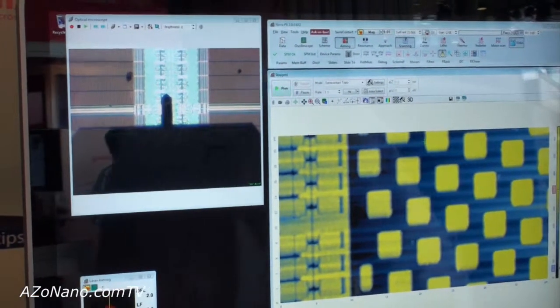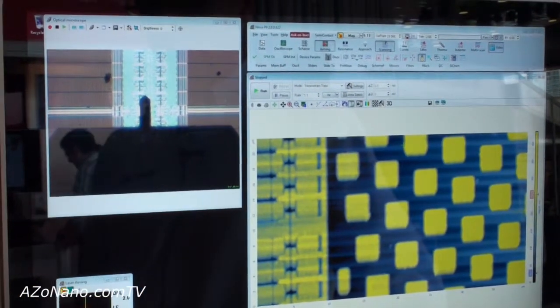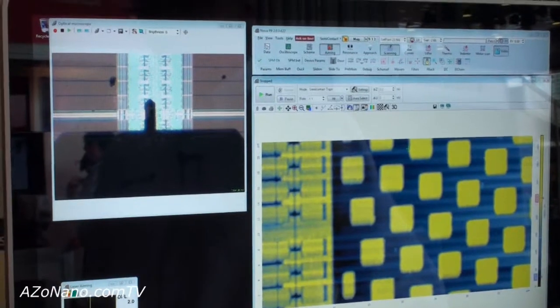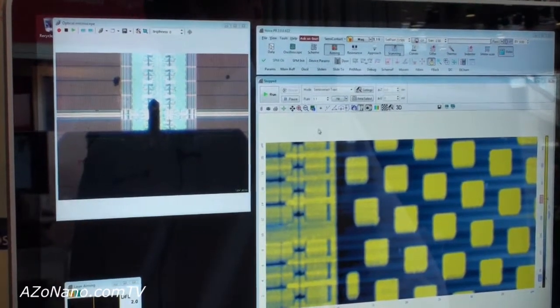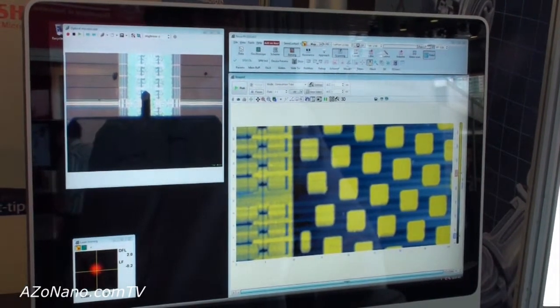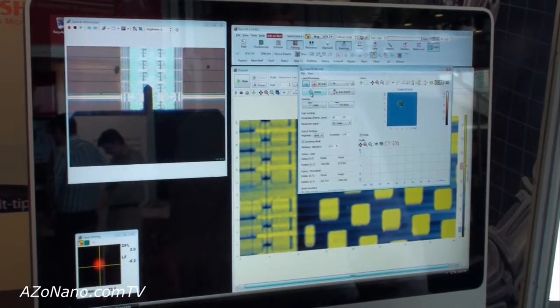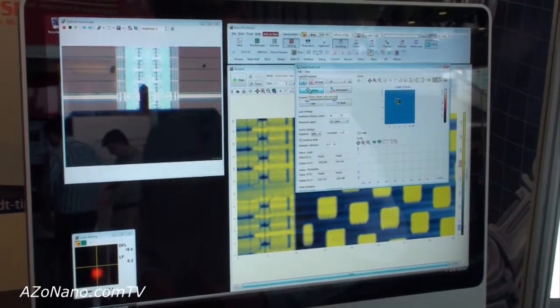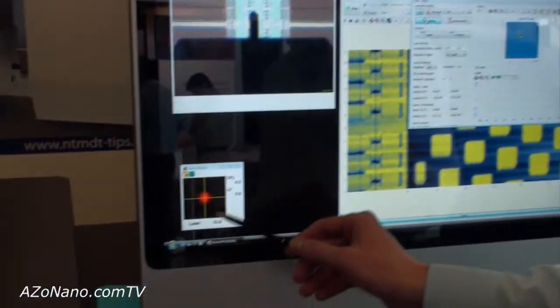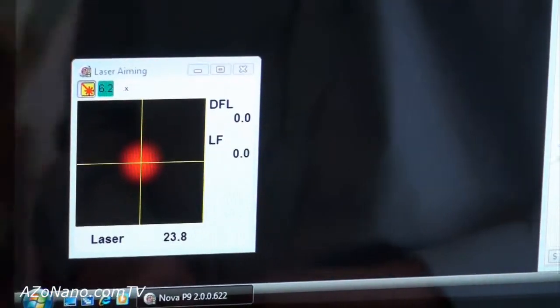These are preliminary operations which are normally done to allocate the area on the sample surface. Then we can start measuring the sample. We align the laser to the cantilever, which is also automatic, just one button. The system starts to make scanning by laser beam and align it to the center of the photodiode.